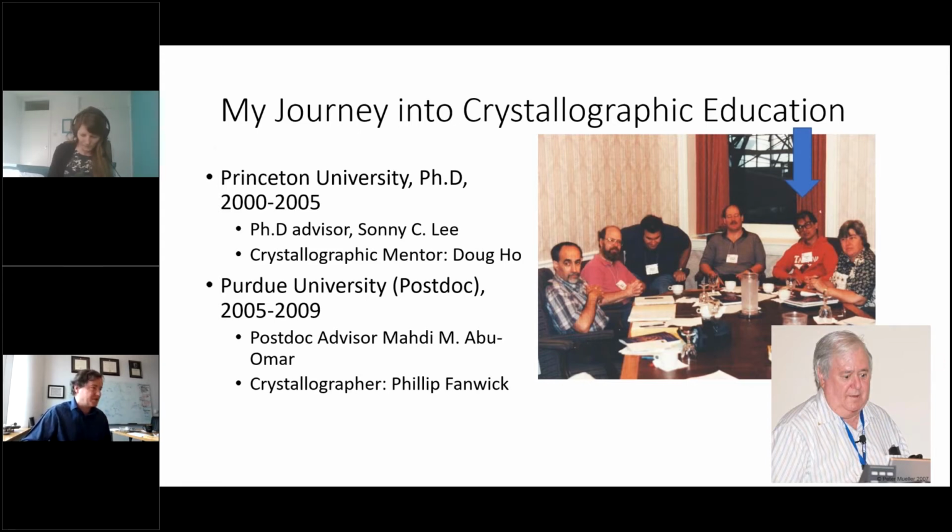But the nature of learning crystallography when you work in a lab is that it's a practical education. You learn how to treat the data. You learn when to do what, and how to go about it, how to go about solving certain pitfalls. But there's not much of an opportunity for a base level theoretical understanding. Of course, Doug has that understanding and would answer my questions appropriately when I was confused, but I never felt I really fully understood what was underneath all of the software and all of the steps.